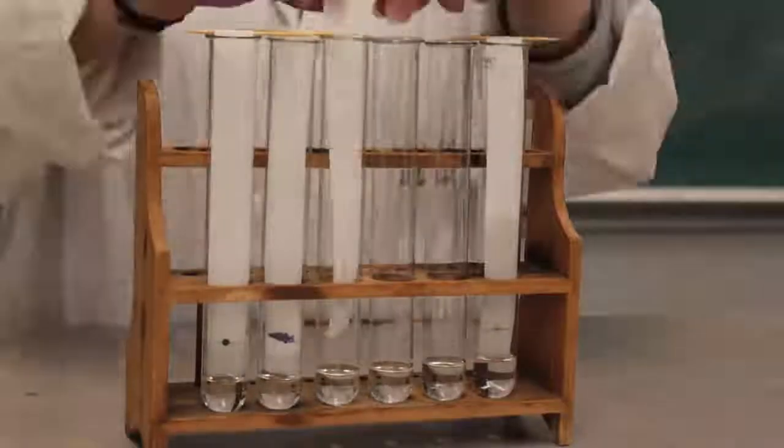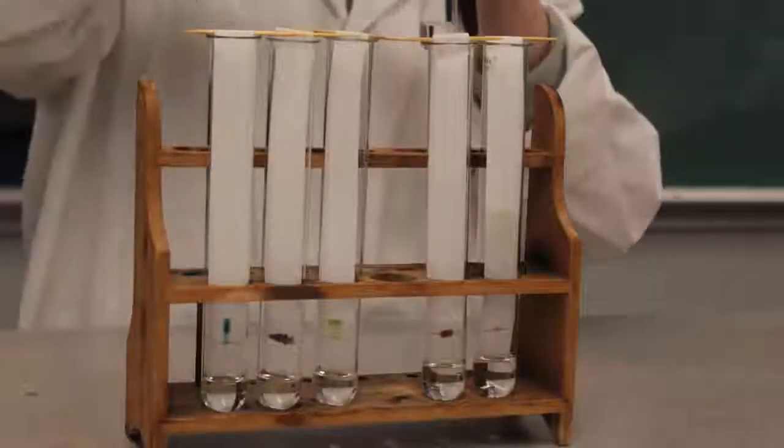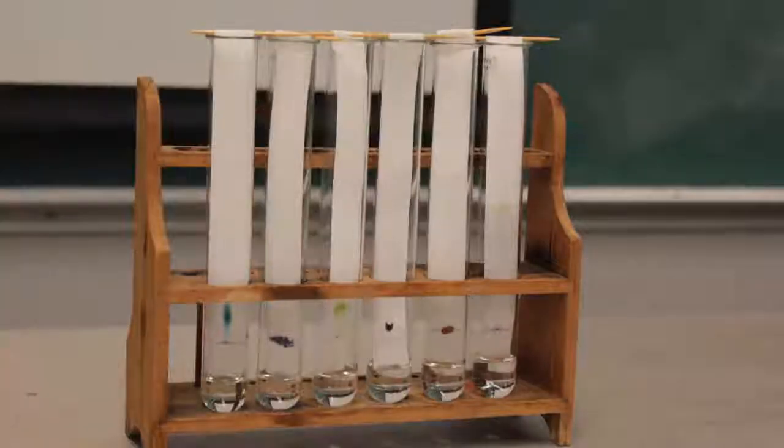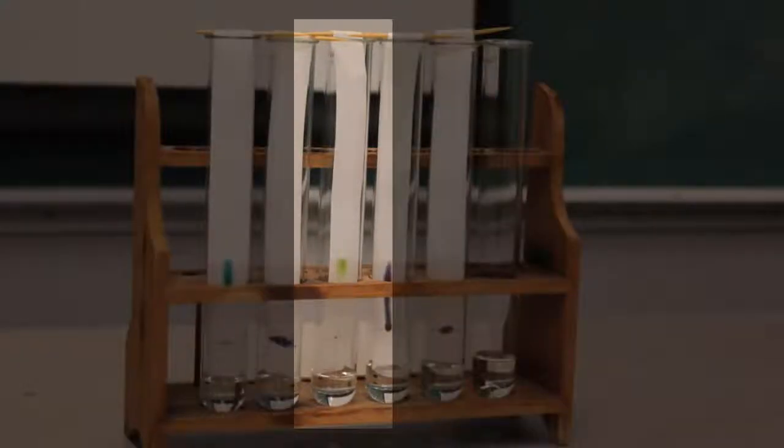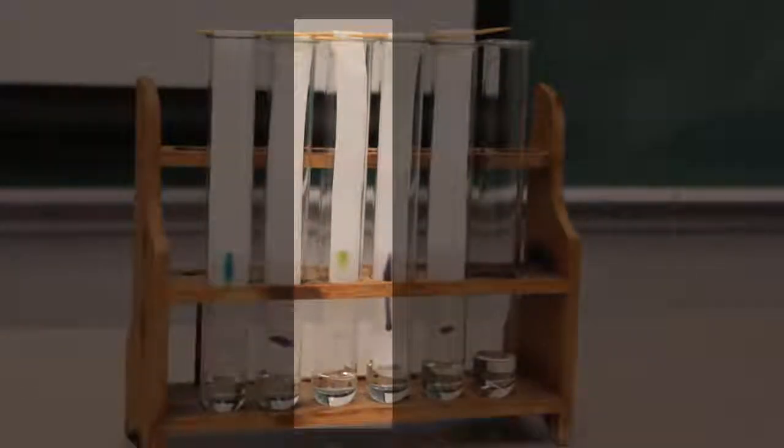Once your test tubes are ready, insert the filter paper strips so the bottom is just touching the acetone solution. The acetone will wick up the paper using capillary action and carry the pigment as it moves up the filter paper. Here we tried many different samples. You can see the leaf pigment in the center, highlighted.